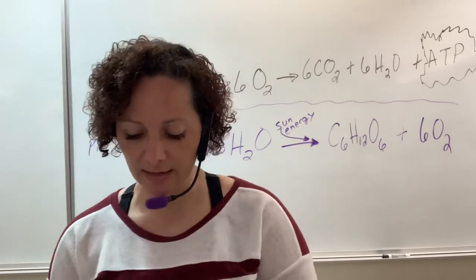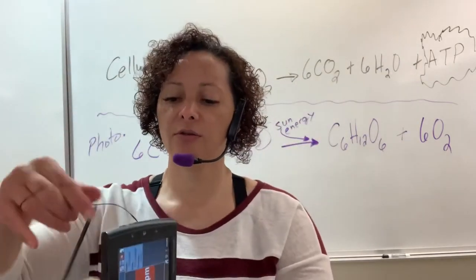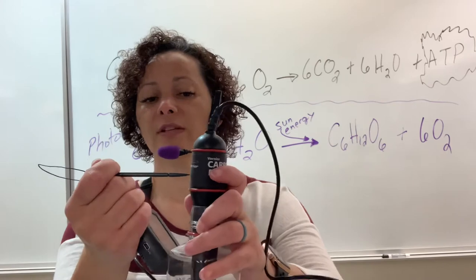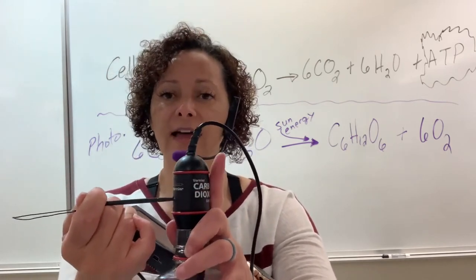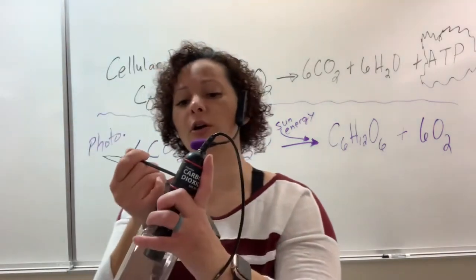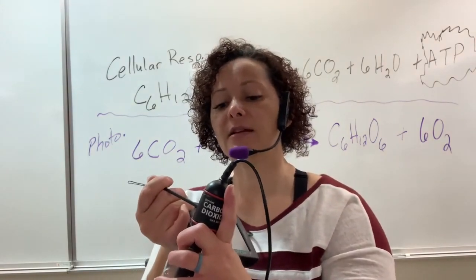In order to calibrate, place these in the chamber. Trying to show you everything all at once. Luckily, you have somebody else and you put your hand on the table. You're going to hold this in here and hold it until that red light on the side stops blinking and holds solid red. About 30 seconds. I have to look at it. There we go.